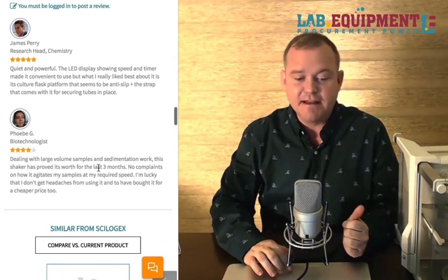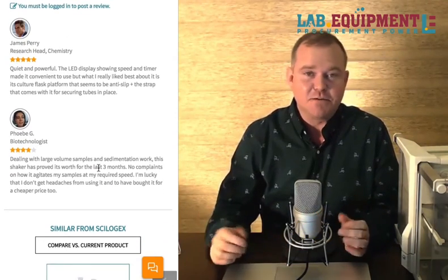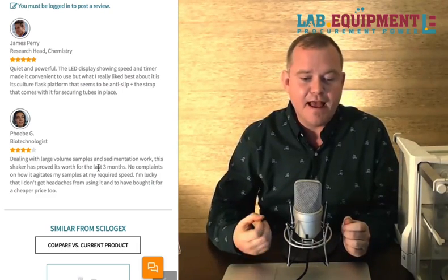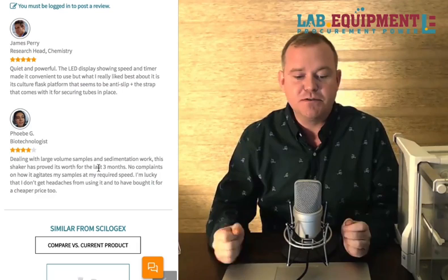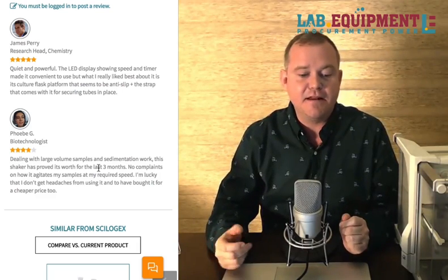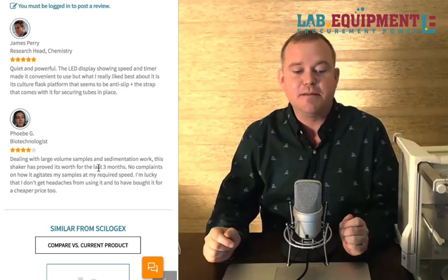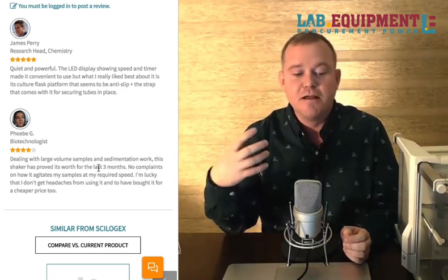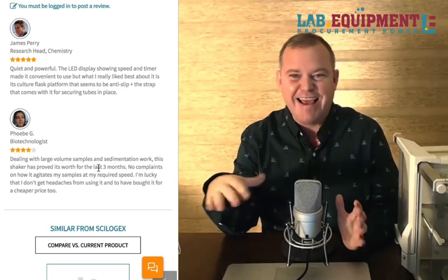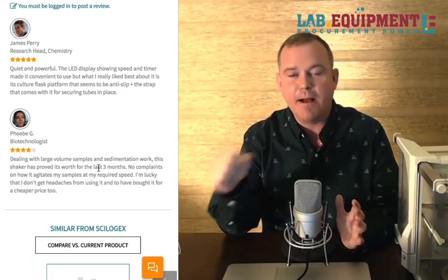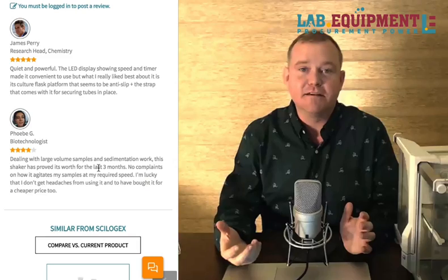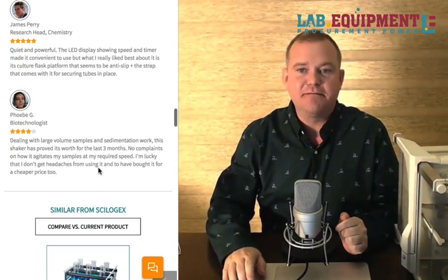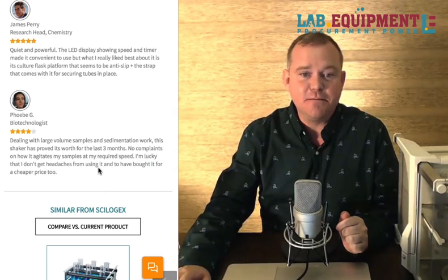James gave it five stars. He said it's quiet and powerful, relative to the other shakers that you have in your lab. The LED display shows speed and timer made it convenient to use, but what he really liked best about it is how secure the samples fit on there. The culture flask platform has an anti-slip surface and a strap that comes with it for holding the tubes securely in place.